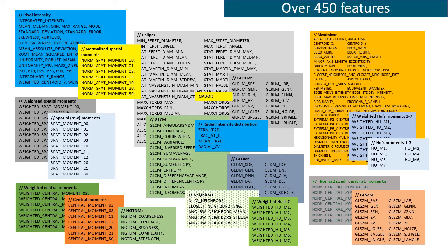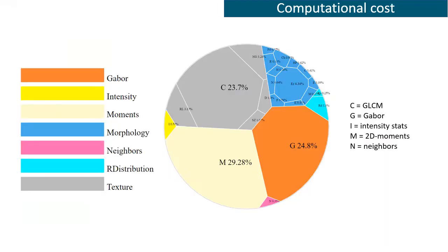The purpose of this is saving compute time, because each feature family has its own computational costs, and those times to compute are quite uneven. As we see, feature groups take significantly different time. So we designed the Nyxus architecture to perform calculations efficiently.